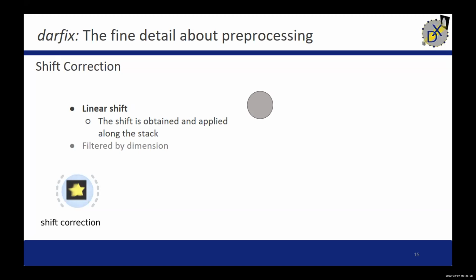Since it's induced, the moment you apply a threshold of 1, it's gone, and you're not losing any further data. Okay, perfect, thank you. And one second notice on the dimension widget. In my data, for the y dimension, if I do find dimension, it takes the wrong step size. I correct it manually now, it's no problem, but I noticed that for all other dimensions it's correct, but for this one it takes a wrong one by a factor of 10 or something.